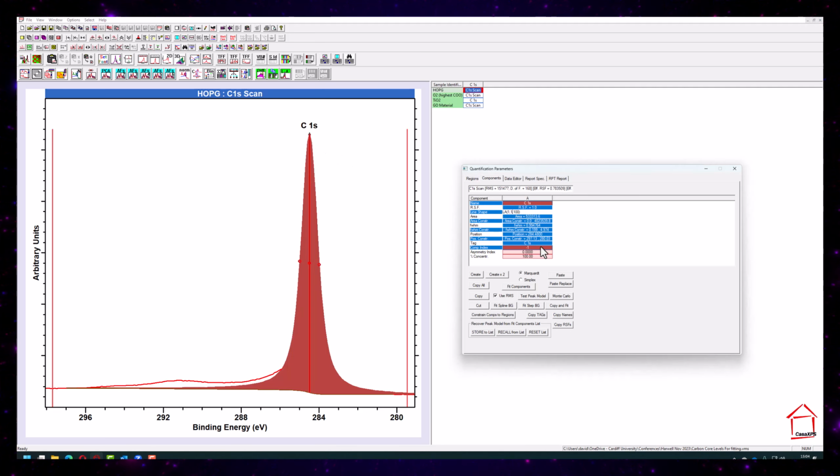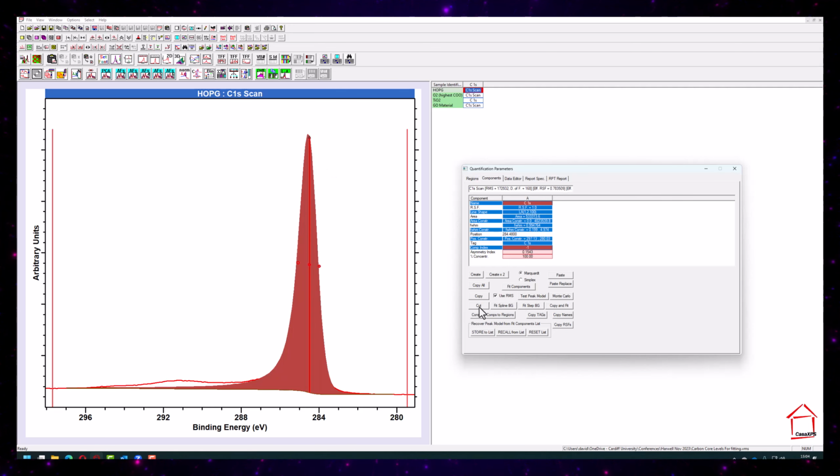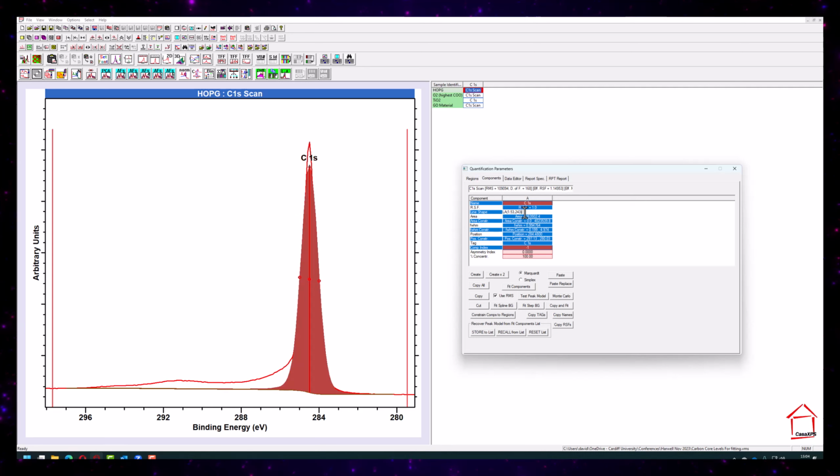If I change this second component to number 2, for example, you can see if I colour that in, it's pulled this right hand side of the peak inward. So what we want to do is generate a peak which is suitable for this sort of asymmetric shape. So let's just delete that and start again. So we want something with some asymmetry. So we will use the 3 parameters, and let's start with 1, 1 and the third number, it's 243 at the moment.